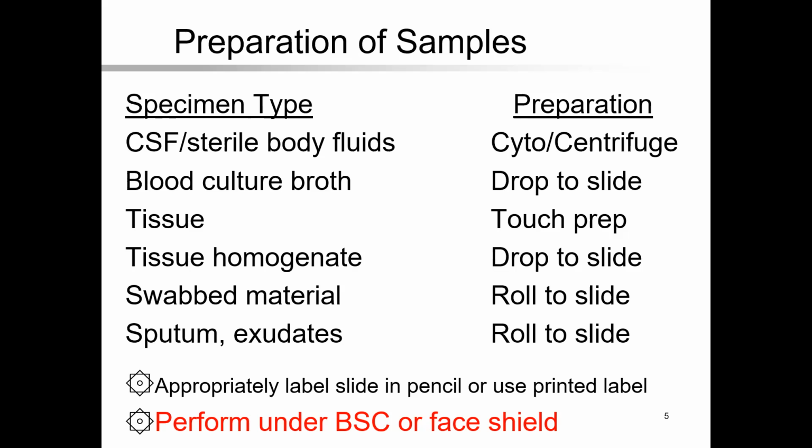We want to use pencil here because oftentimes the decolorizer will take off any kind of ink or label you're using. And that crystal violet can really darken your label, make it kind of unreadable.